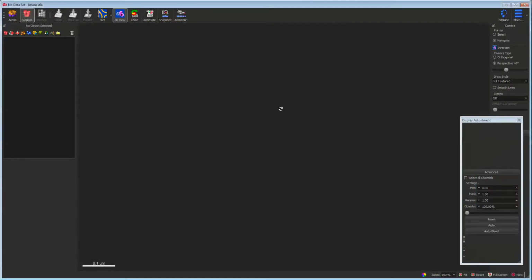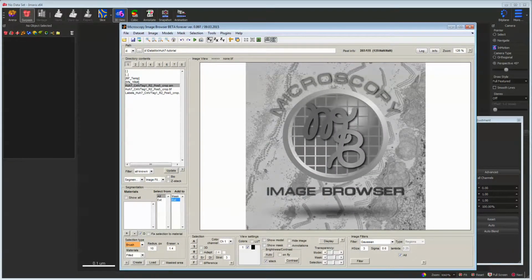Depending on the installation you may have ImarisXT. It's an additional module which offers the possibility of direct data exchange between Imaris and external programs. So if you have this module, then the data can be directly exported from MATLAB to Imaris. However, if it is not available, then the data and models have to be saved to disk in TIFF format and opened in Imaris.